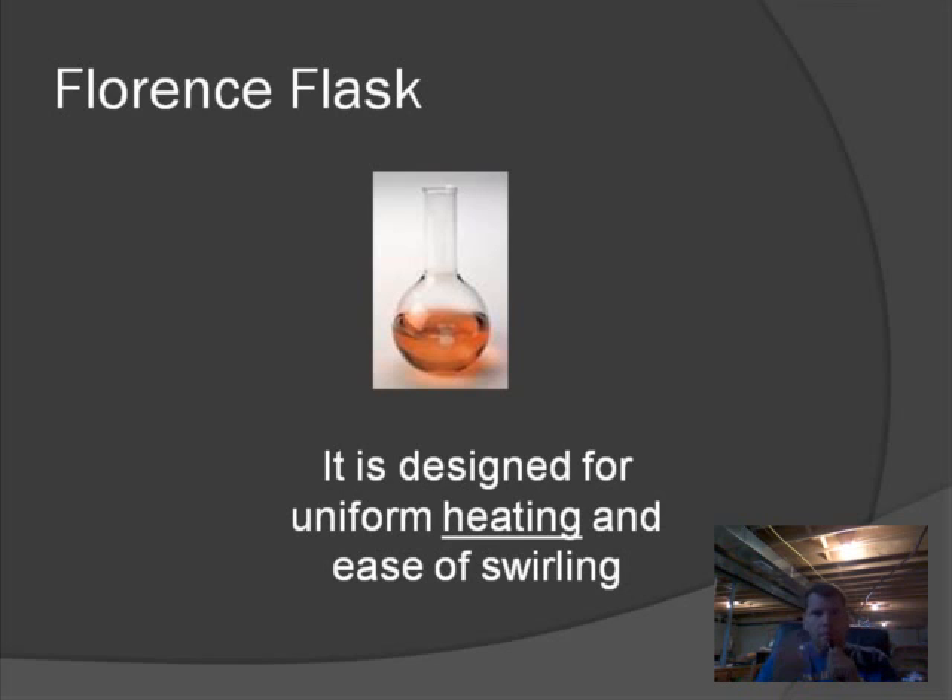Also, with that round bulbous shape, you can grab the neck of the Florence Flask — that long top part — and swirl it around. If you have two liquids together and you want to mix them, you can swirl them and the liquid will stay in the flask. If you try to do that with a cup shape, the liquid's going to fall all over the place, on your shoes and clothes. So that's the Florence Flask.